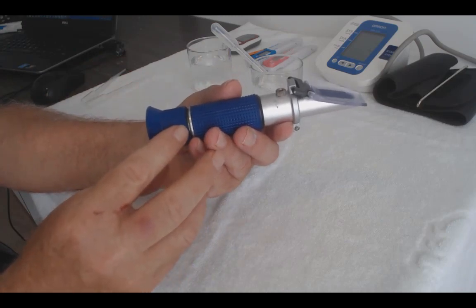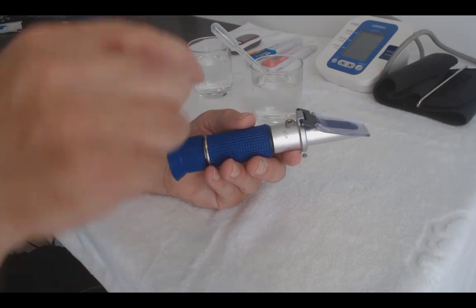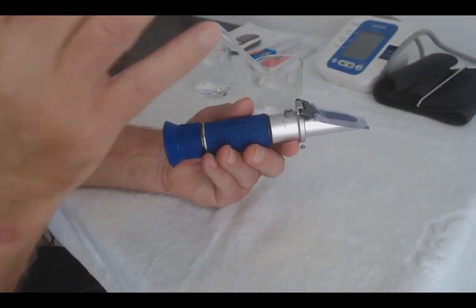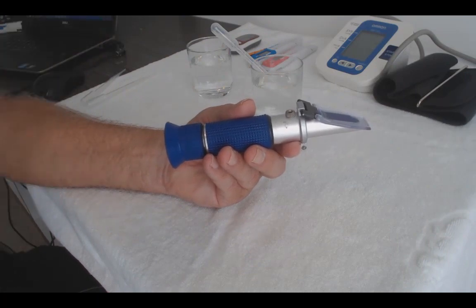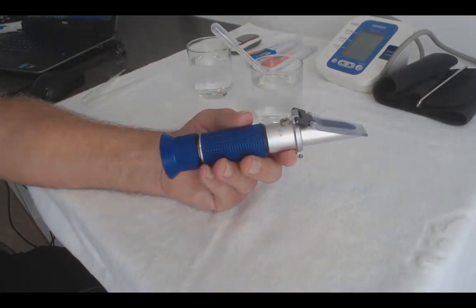Most of these are going to be calibrated fine, no problems at all. But if not, there's a little screw at the top here which you just have to turn, and you can adjust it, and you'll see the little marker adjust up and down. Okay, so 0 is what we're after.